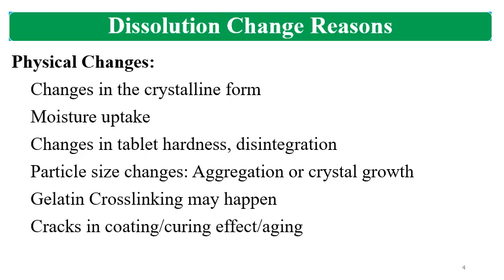Now we will see why the dissolution failure occurs during the stability. See, there might be changes like physical changes, chemical changes, or microbiological changes, packaging related issues. Many problems are there. Many of the reasons are product specific. So, physical changes like change in the crystalline form of the API, change in the crystalline form from more soluble to less soluble may result into dissolution failure.